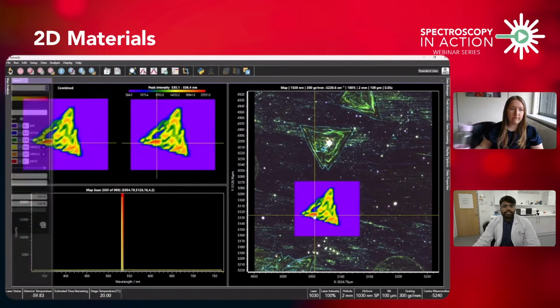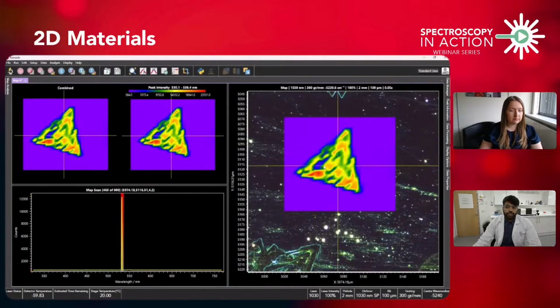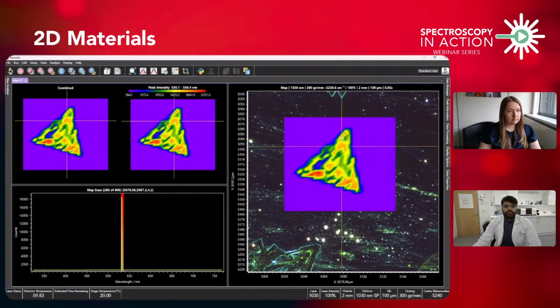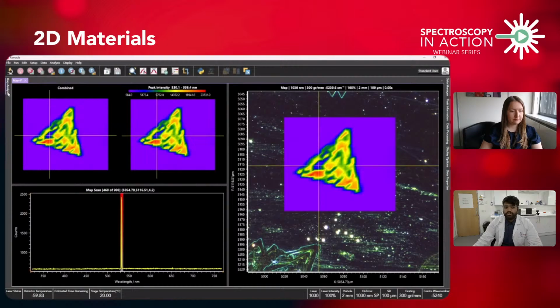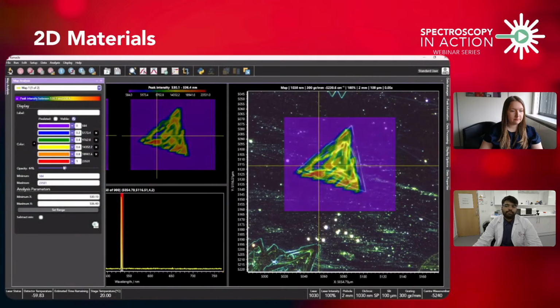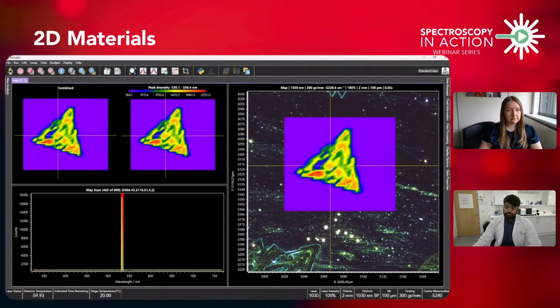Okay, so we can see quite clearly on this flake that we have differing signals of the SHG over the flake itself. We can see quite clear domains, and we can actually see grain boundaries present on the flake itself, which aren't as apparent with Raman and PL. We can see quite nicely there that we can identify different regions of SHG on this map. So I'm going to hand back to Angela, who's going to show us a high resolution version of the flakes that we actually have.